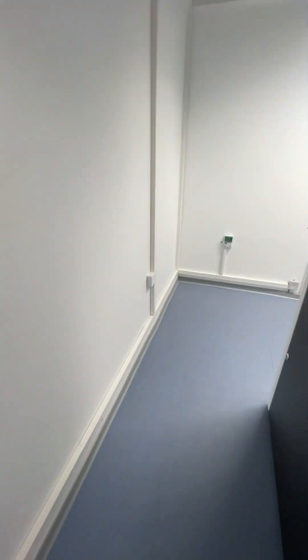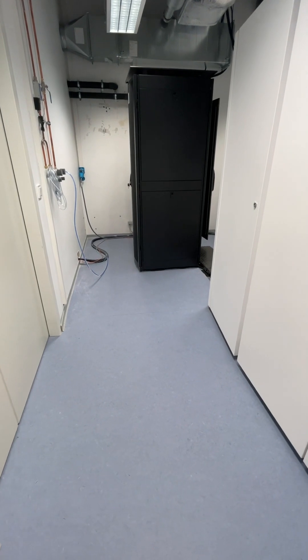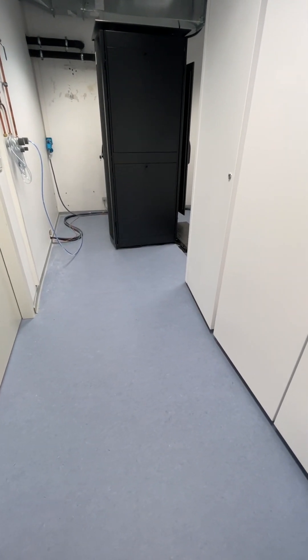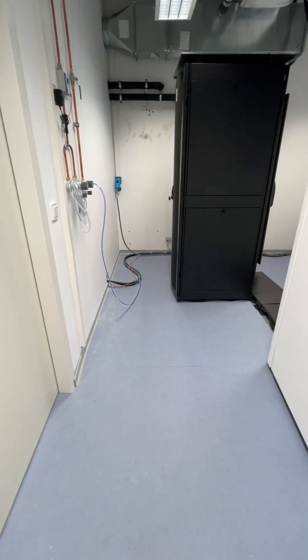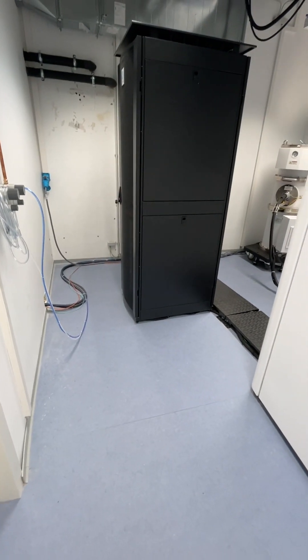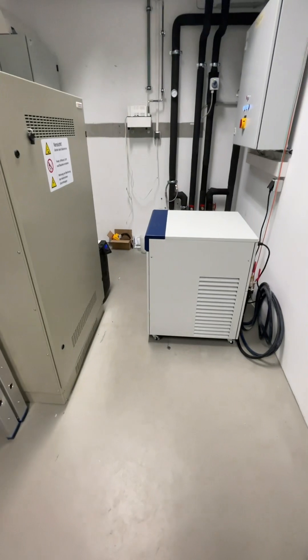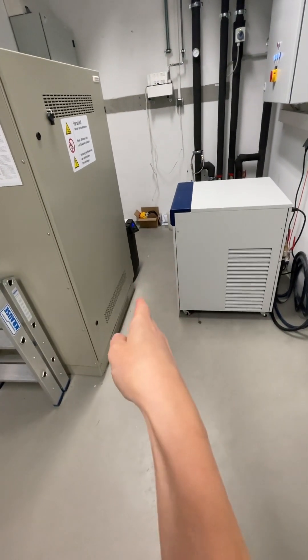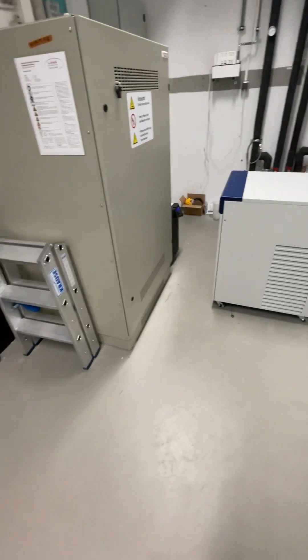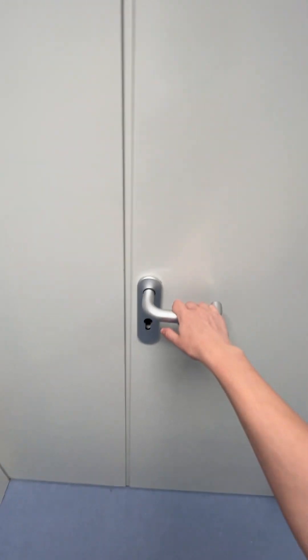One other thing to mention: this room is enclosed — fresh air can't freely come in or go out. That means that because we are filling liquid nitrogen, we could be building up nitrogen levels in the room. We keep this door shut because of the noise — this is our water chiller and backup power — and we don't want that noise or temperature fluctuations affecting the microscope.